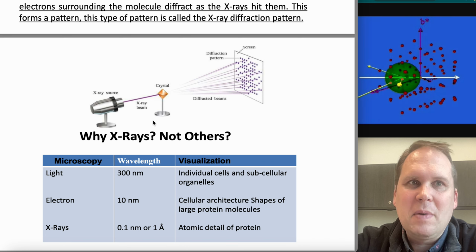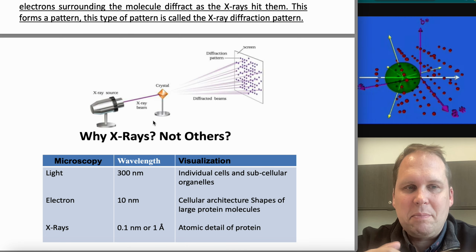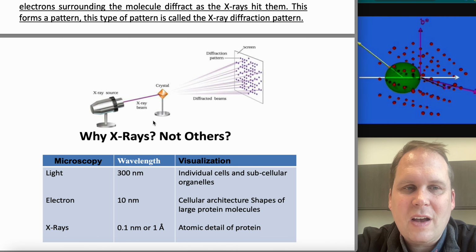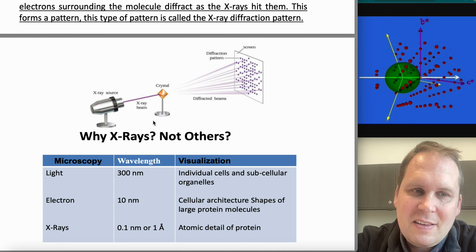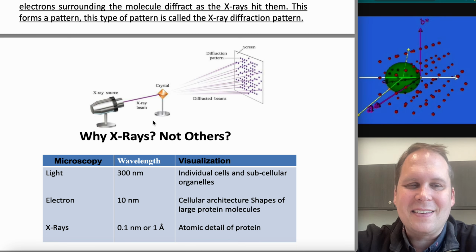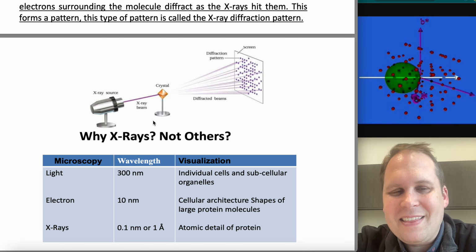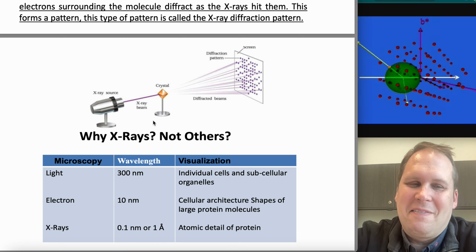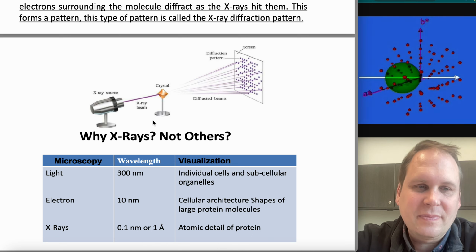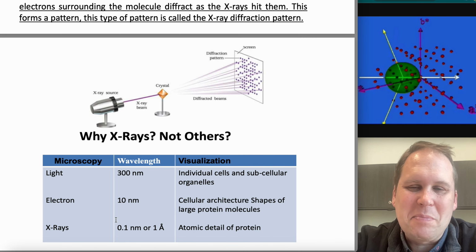Most proteins, nearly all proteins, do not behave like crystals when they're actually doing their job. So essentially, none of these proteins signed up for this. None of them was naturally selected for its ability to form crystals. And so you're trying to get things to crystallize that don't know what a crystal is, essentially. Why X-rays? Well, duh, yeah. The wavelength's small enough.